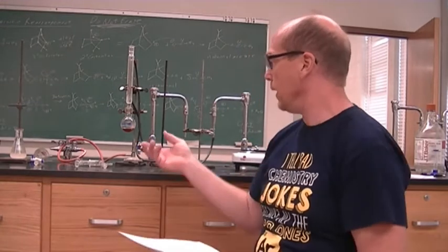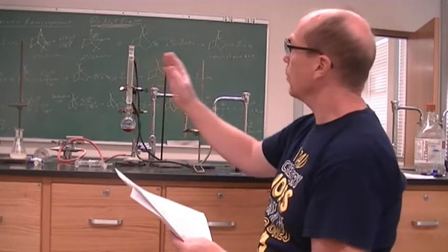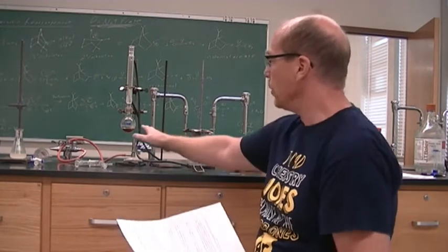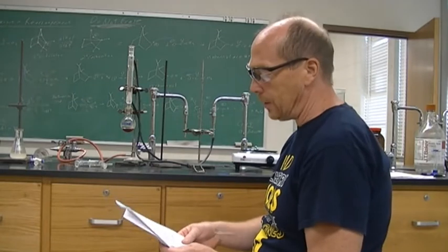and I had a liquid product, okay? And so I weighed my liquid product. The liquid product weighed 2.90 grams, and that's our actual yield. We can get our theoretical yield and our percent yield from reaction one. All right, and so again, the product mass was 2.90 grams. And so I took the entire amount, the 2.90 grams of isobornyl acetate, and to that isobornyl acetate, I added 7 milliliters of a potassium hydroxide solution.